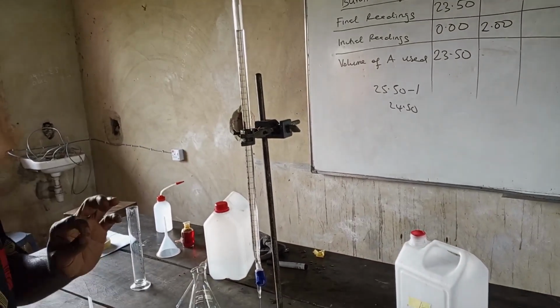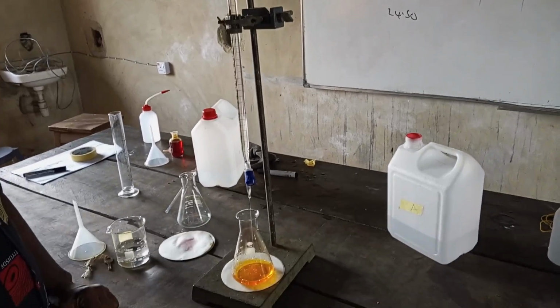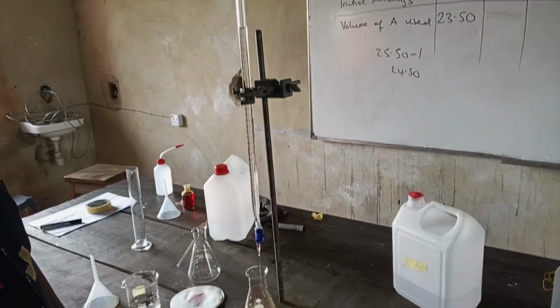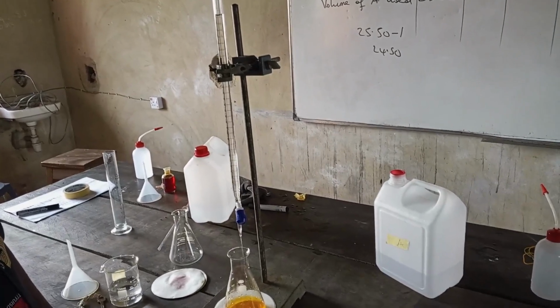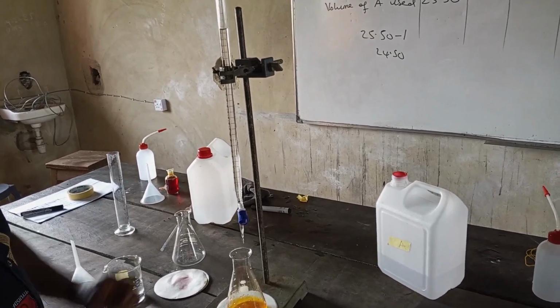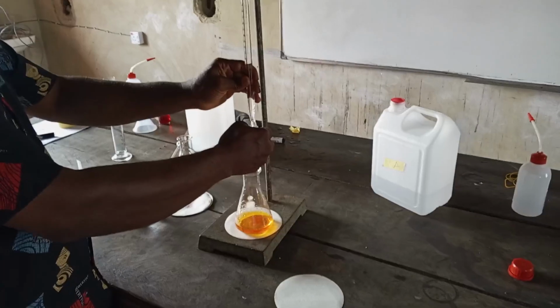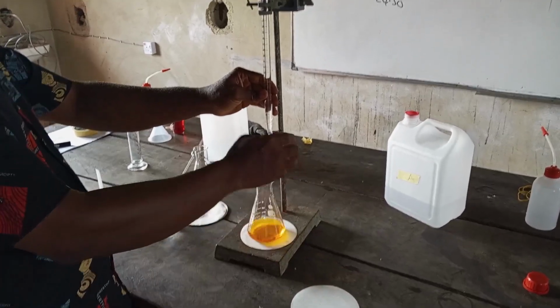I'll now take it drop by drop. So it's about there. Okay, it's at 24.5. Almost close.